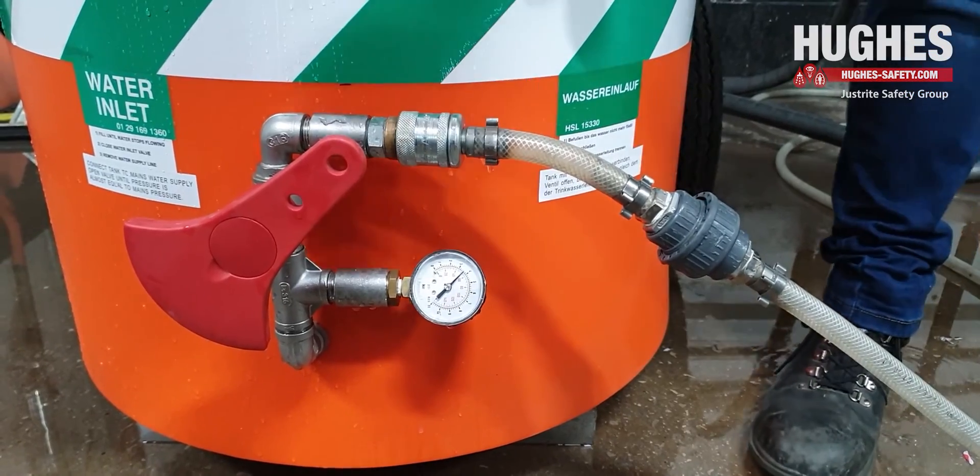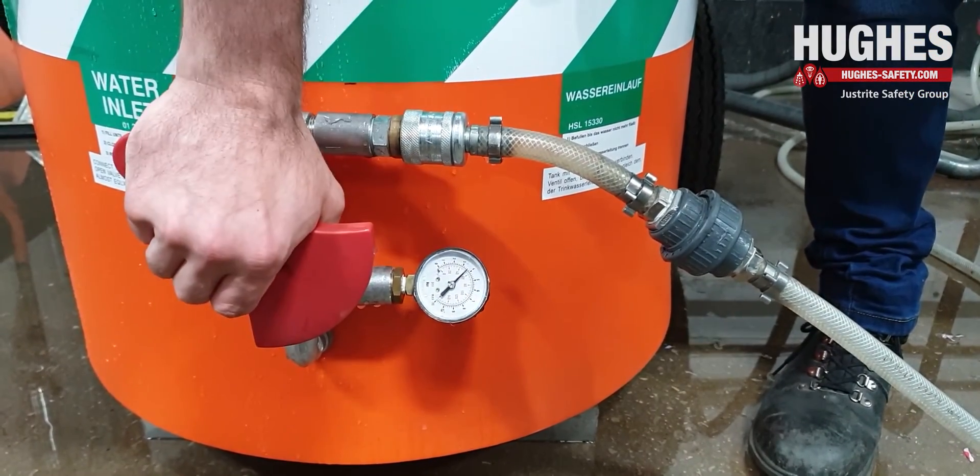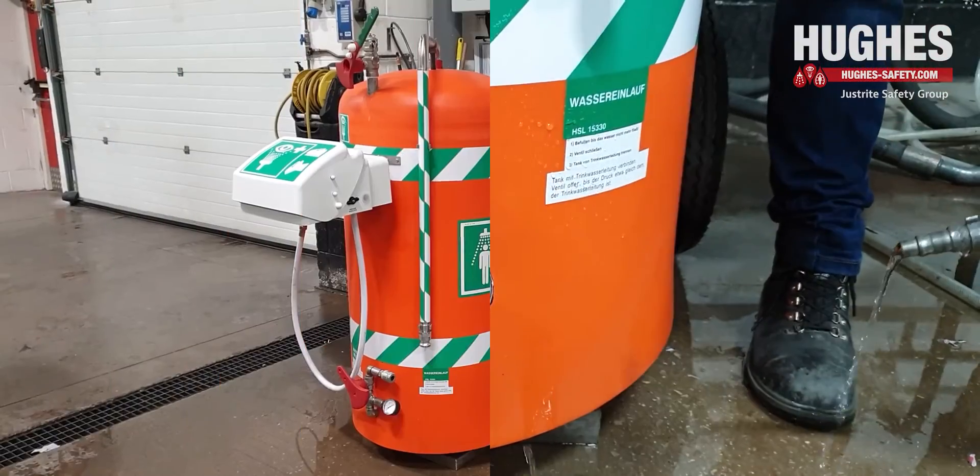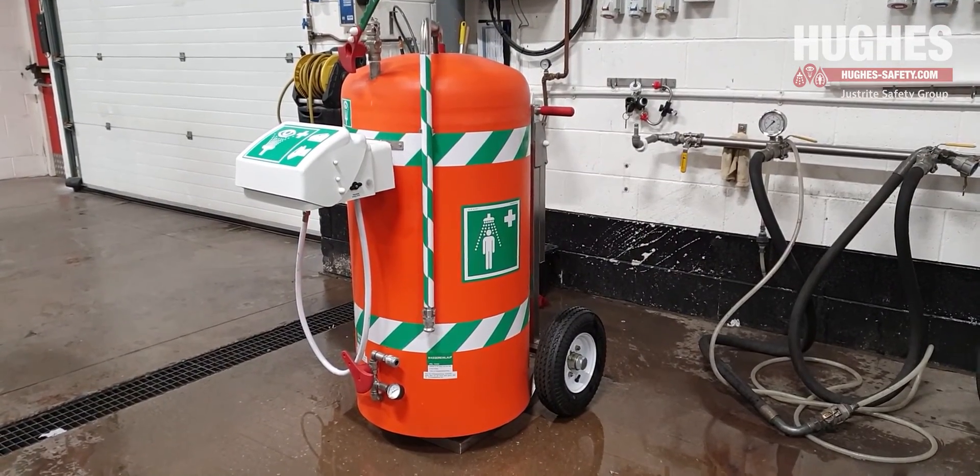When the unit is full, close the water inlet valve. Then disconnect the hose adapter. The unit is now ready to use.